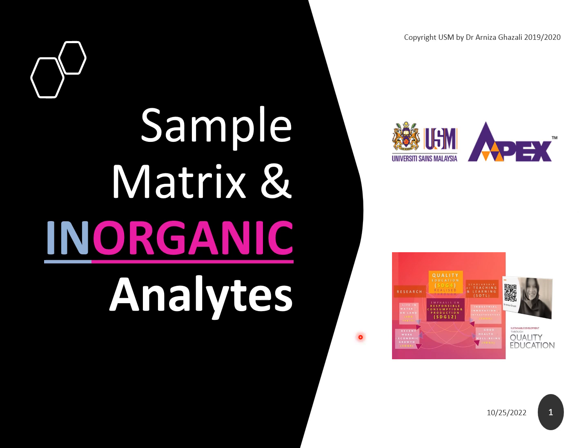Now let us look at sample matrix and inorganic analytes. You may recall, sample matrix refers to the holder of the unknown that we are interested to study. And that unknown is called the analyte.